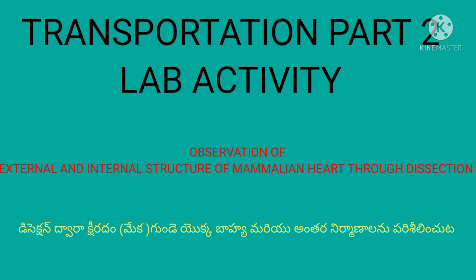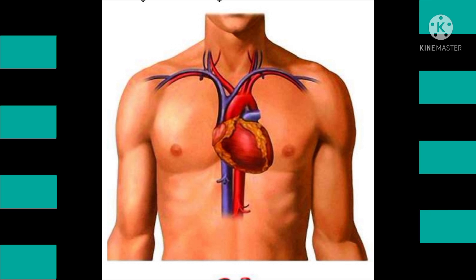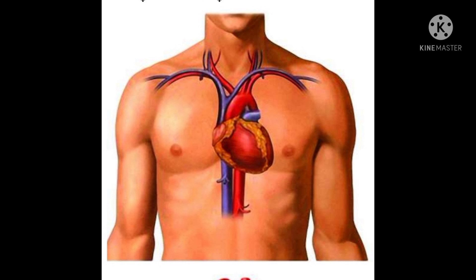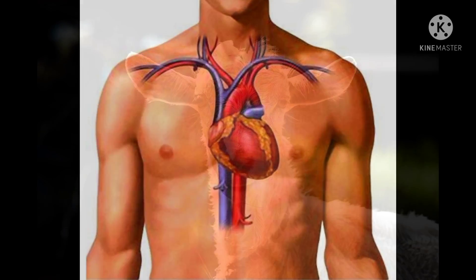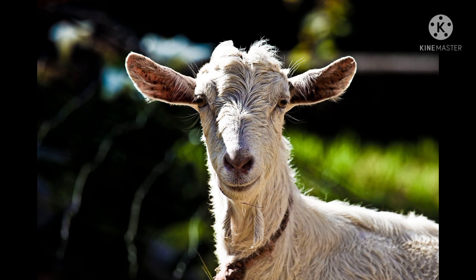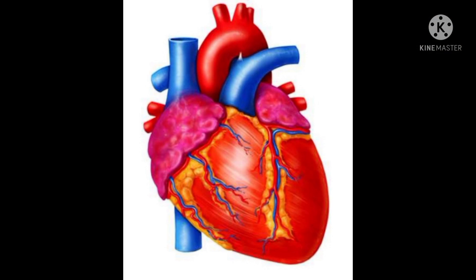Hi students, welcome to Umma Science Guru. In the previous video you learned about the structure of the heart. For this video, I collected a mammalian heart for today's lab activity — that means dissection. The structure of all mammalian hearts is similar; we take the sheep's or goat's heart for our observation. When you observe the external structure, it looks pear-shaped with a triangular outline, covered with the pericardial membrane and coronary blood vessels.